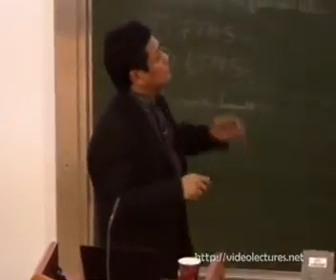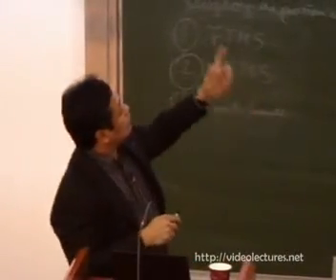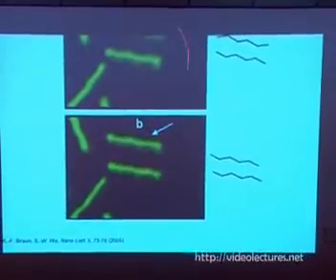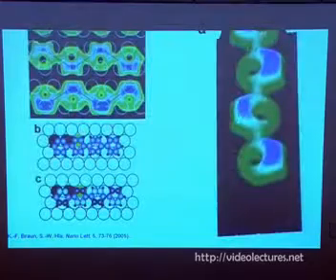So the question is, we know that this molecule's pi rings are twisted in the gas phase. Is it still twisted on the surface like this? We don't know. By luck, and I'm sorry again, the image is cut off at the top here, we have this image where before we have the opposite wiggle. At the next scan, the molecule switched and appears with the same wiggle. So this proves that by moving forward, the molecules can change the wiggle arrangement correspondingly.